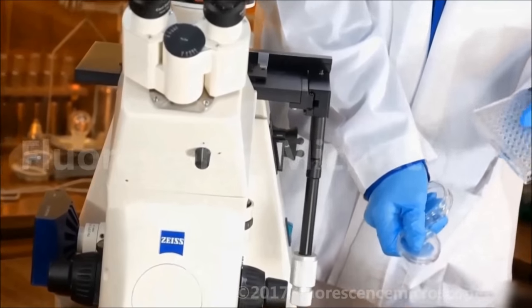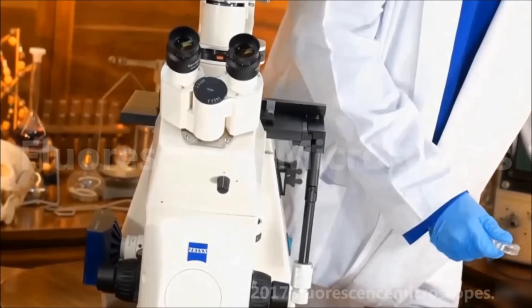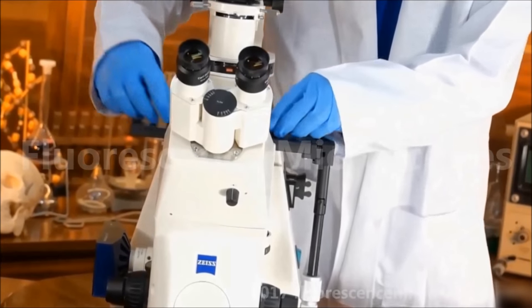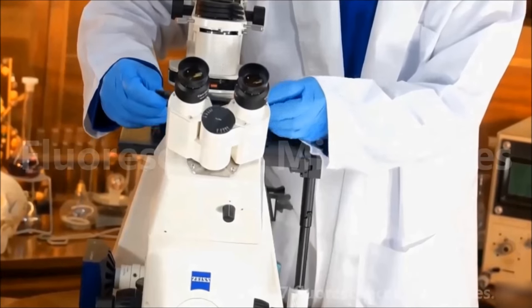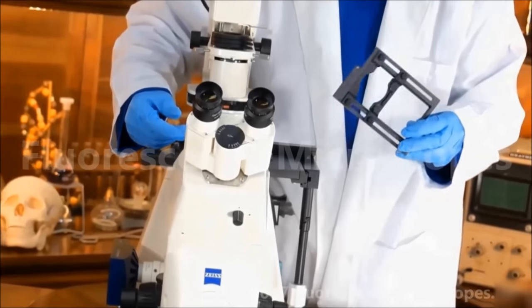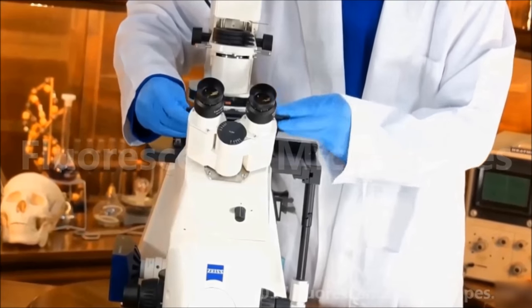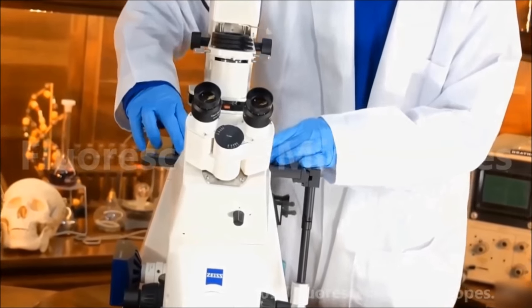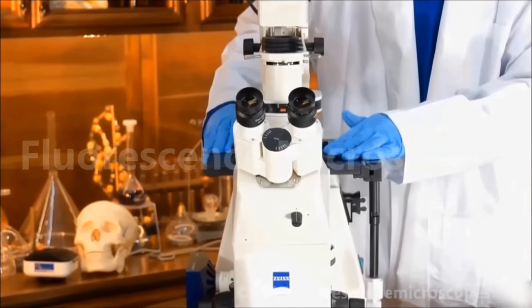This is a 96 well plate. If you need other stage plates, stage mounting plates, then let us know. We're including a universal stage mounting plate. This will hold a Petri dish or a slide, a typical one by three inch glass slide. But there are a variety of other stage plates.